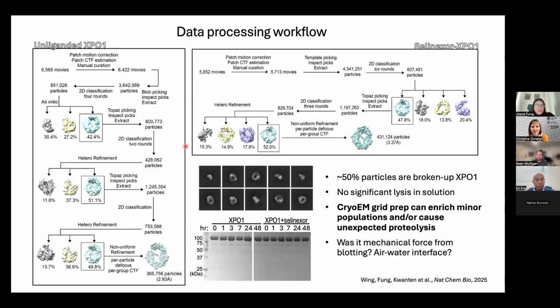But obviously, I think it's different for different cases. This is also a case that speaks to how important your sample is, because it's purified so well, since we have crystallography grade protein, that it worked the first time. But if it were a less clean sample, I would have to work a little harder at that.